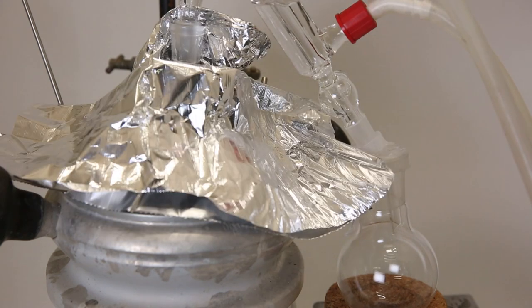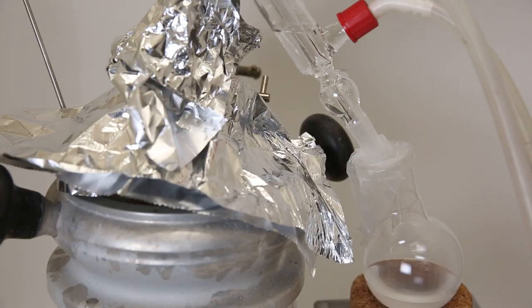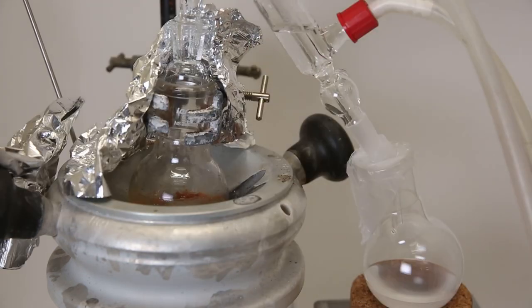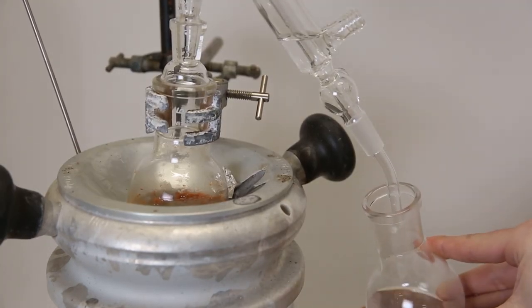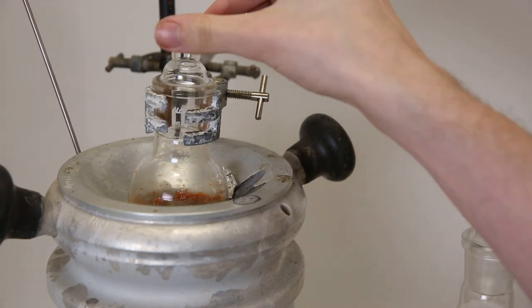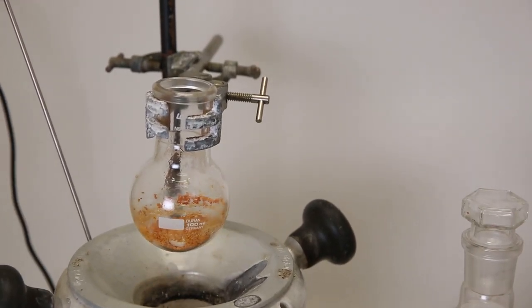So I bring the liquid to a boil and insulate it with some aluminum foil. After a while, nothing came over anymore. So I remove the aluminum foil and see that all the liquid is gone. I remove and stopper the flask with the benzene and take apart the setup. We can see that all that is left in the flask is some orange stuff mixed with the calcium chloride.